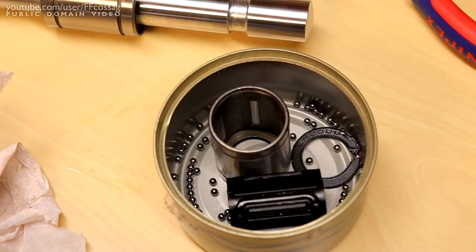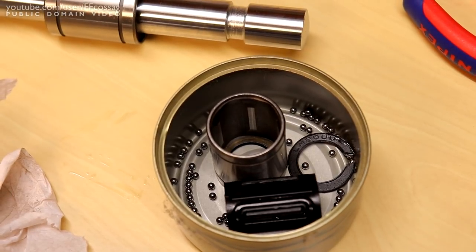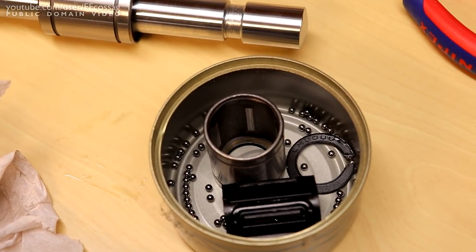And since there's quite a bit of pressure on these little tiny balls holding the entire boom arm up, that's of course going to result in tremendous pressure when everything just starts oscillating and bumping up and down due to the terrain, just vibrating down the length of the arm and moving the heavy microscope head up and down.